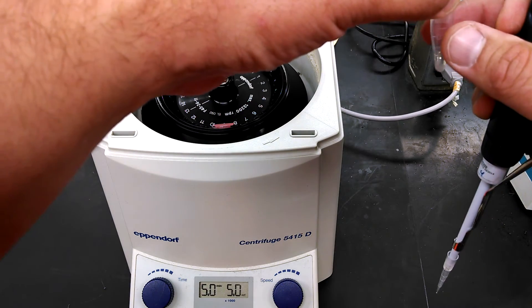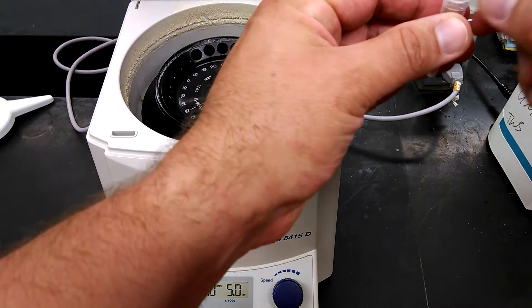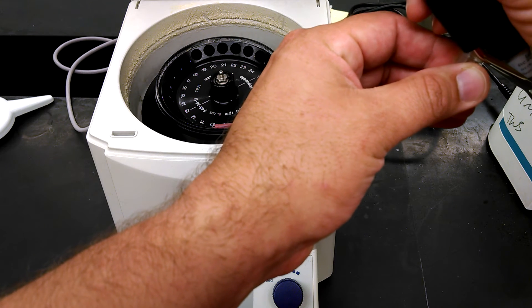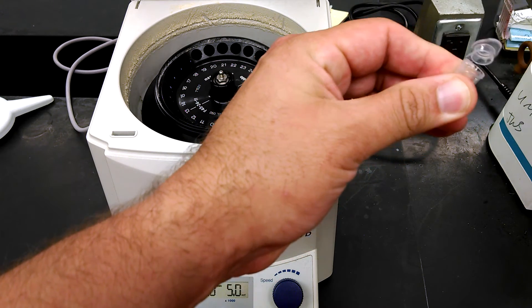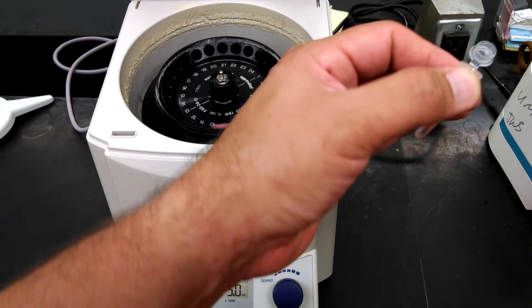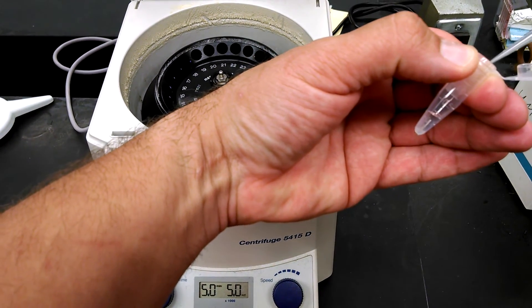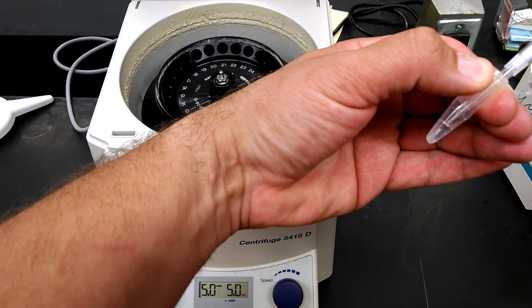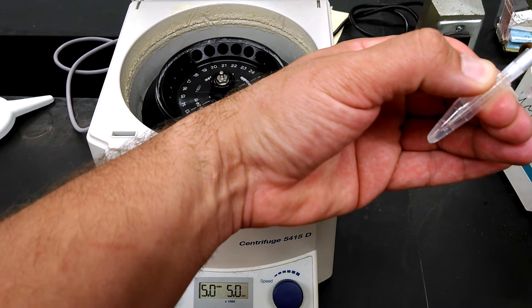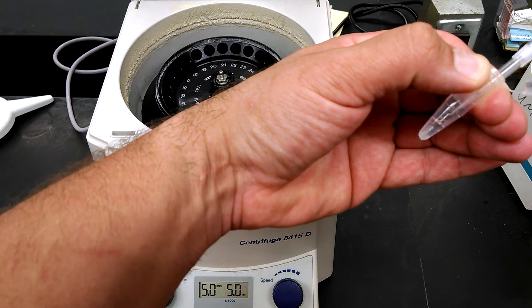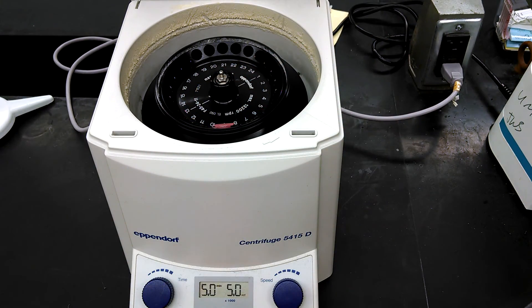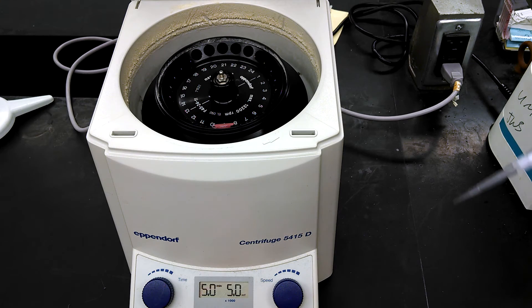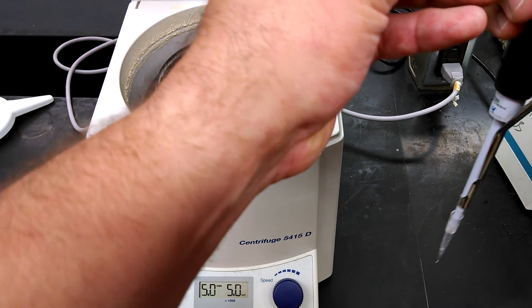And we don't want any of those beads, so we're going to move this very gently, gently pop the top. And when we pull out our sample, we're only going to put the tip in the very top of the sample, because we don't want one of those beads. And if you do that, your PCR works beautifully. If you get one of those beads, you get to do your PCR again.